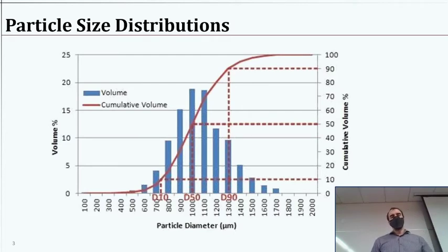So that's why we would take a look at the math up there that I really am just glossing over right now, because that's not really what I want to focus on. It's just background for doing this process. There's that direct way to relate these two concepts here. And so by taking that mathematical approach, we can take this plot that's not particularly useful, but maybe is easier to observe with our instruments, and convert it to this distribution so we understand what portion of our particles are larger or smaller than a given diameter.